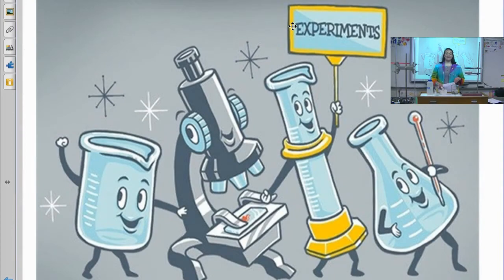Today, we're going to be talking about different pieces of chemistry lab equipment. There's a lot of equipment that when we come back, you guys will get your hands on. Or if you take chemistry in the future, it is imperative that you know the names and the uses of these things. So we're going to spend a little time going through each piece.